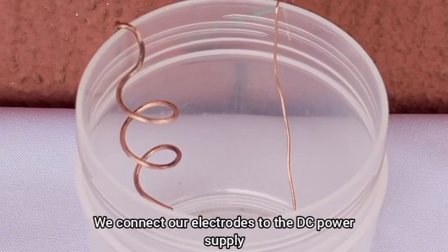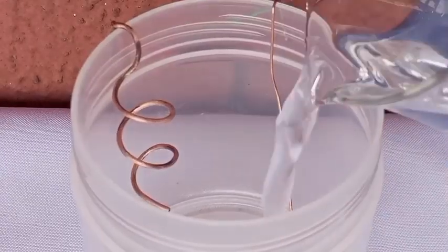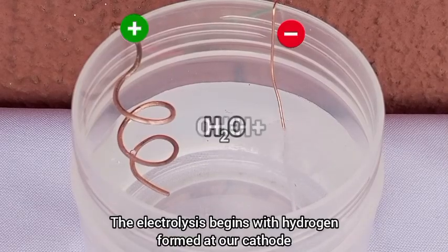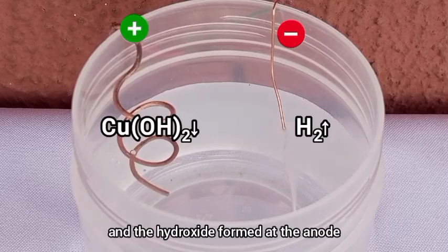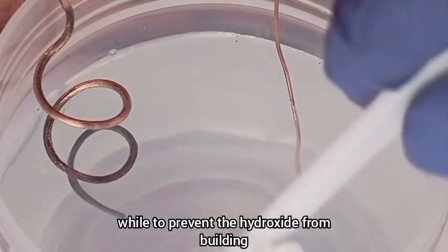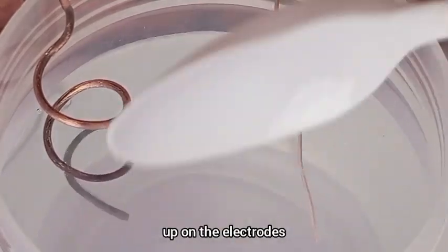We connect our electrodes to the DC power supply, add our source solution, and turn on the power. The electrolysis begins with hydrogen formed at our cathode and hydroxide formed at the anode. It is important to stir the solution every once in a while to prevent the hydroxide from building up on the electrodes.